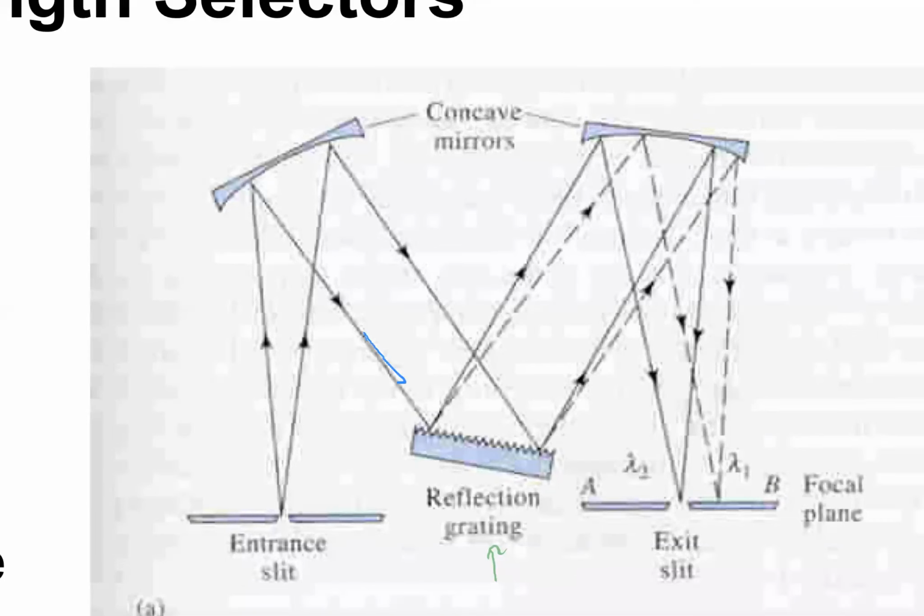So when the collimated input beam comes in and strikes that grating, every single groove, and again, there's thousands on that grating, can act like its own point source and diffract the light off of it in this direction. Think about that for a second. What's going to happen? Well, from each individual surface, those wavefronts could what? Spread out. And in the far field, they're going to recombine either in phase or out of phase, depending on the exact spatial extent. So where does that occur? It turns out it's going to occur down here in the focal plane.